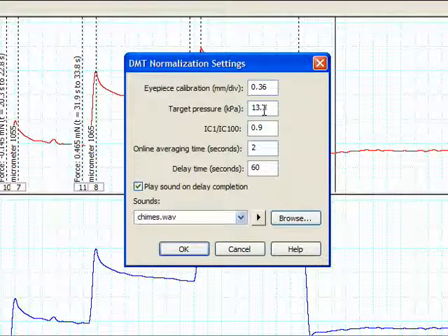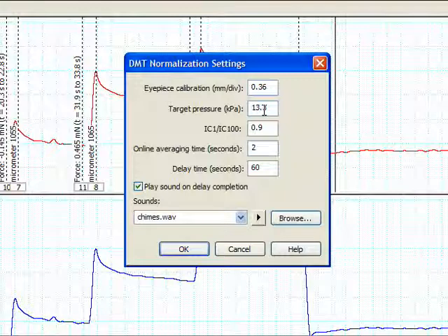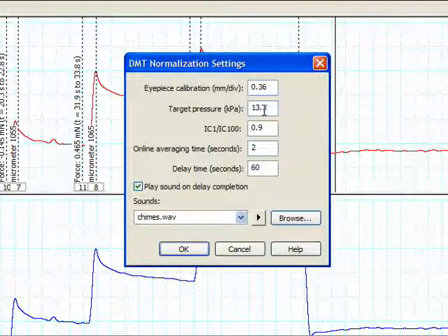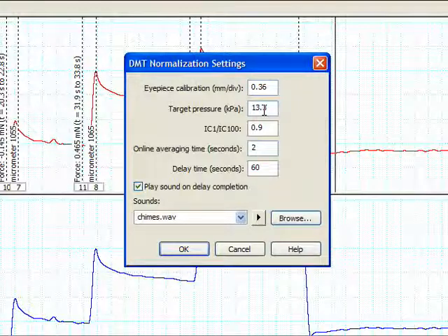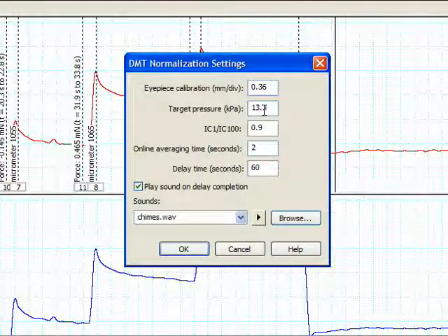The second parameter in the normalization settings menu is target pressure. This is the transmural pressure for which the DMT normalization module will calculate a corresponding vessel internal circumference. Enter the target pressure or use the default value of 13.3 kilopascals or 100 millimeters of mercury.